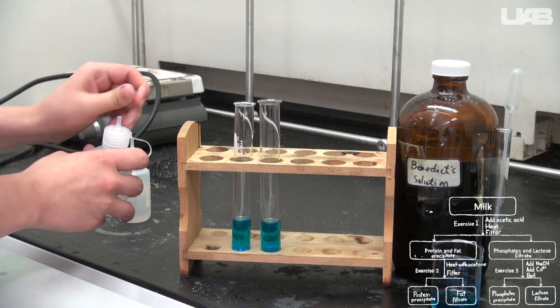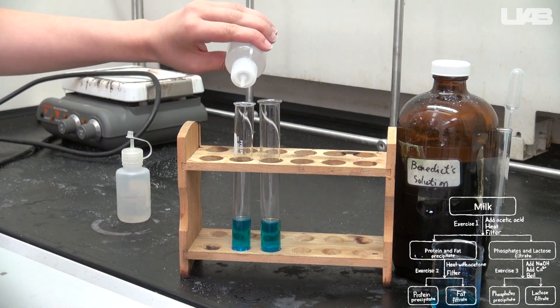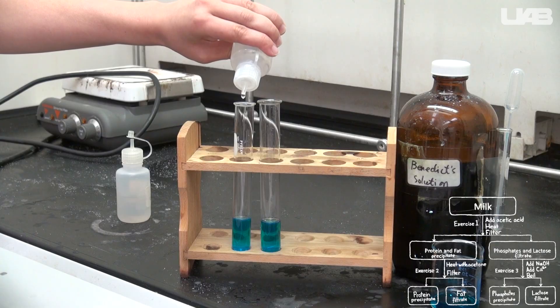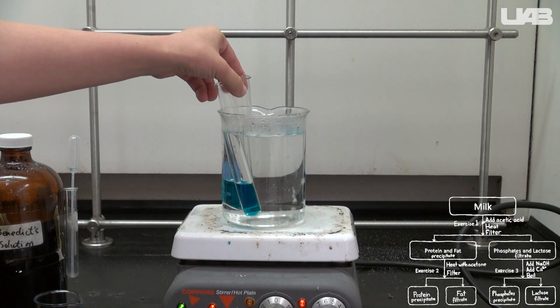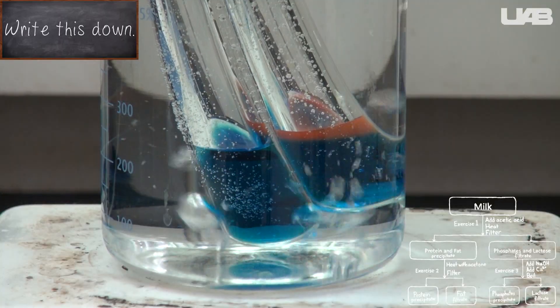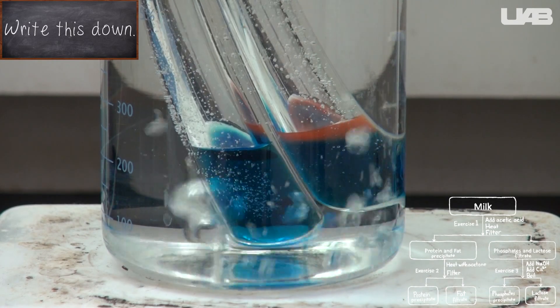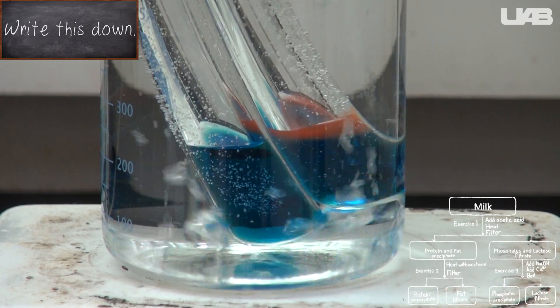In this video, we simply added water to the other test tube to show you what a negative result looks like. Place the two tubes in the boiling water bath and observe the color changes. The formation of a rust color precipitate indicates the presence of an aldehyde sugar.